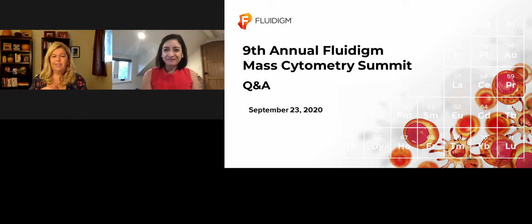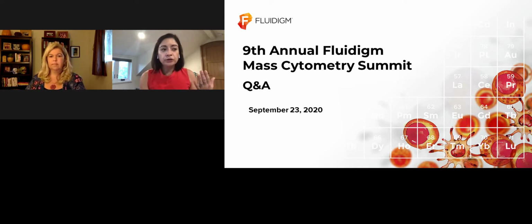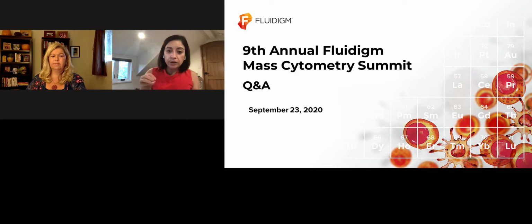Thank you so much. And again, I want to thank our audience for these great questions coming in. Are these types of studies being used in investigating other types of blood neoplasms, disease in general? Yeah, so I think that exactly, there are opportunities also to look at solid tumors or solid tissues, we'll put it that way, both from the standpoint of looking at immune infiltrate, but also looking at the tumor tissue themselves. There's already been some published work doing tissue dissociation to be able to take solid tumors and look at individual cells, which is, of course, one of the real powers of these technologies of CyTOF. So I think those things are coming, and there are protocols and experimental approaches to be able to expand the reach of the technology.